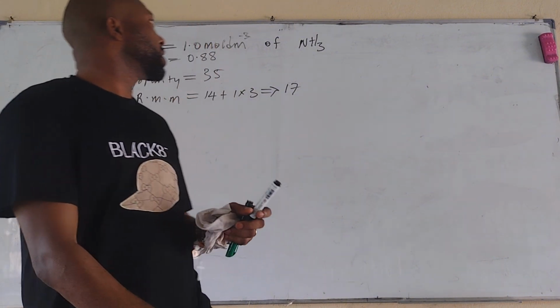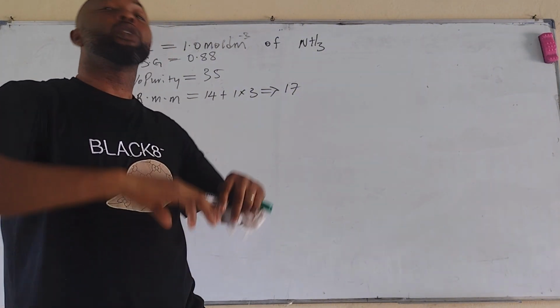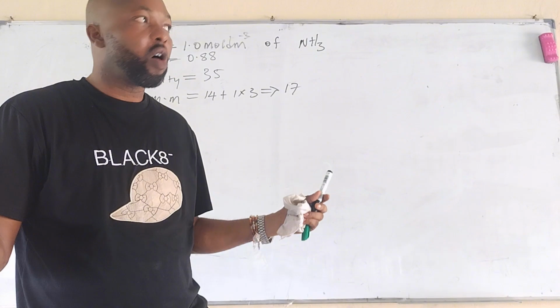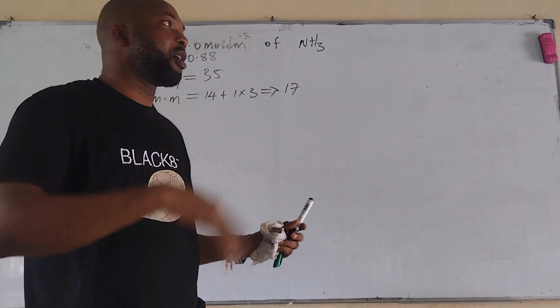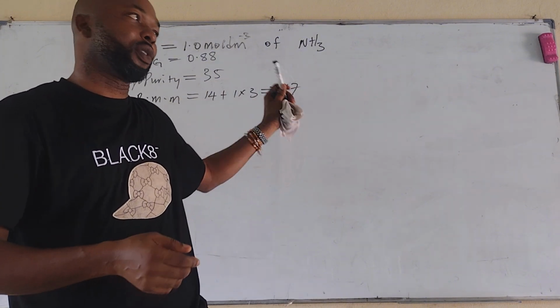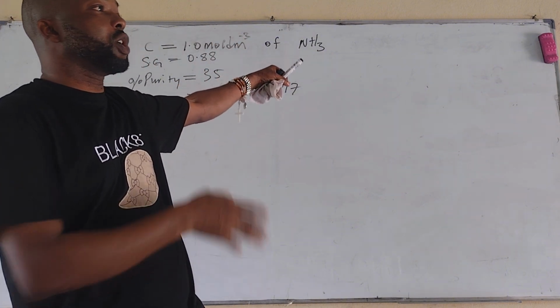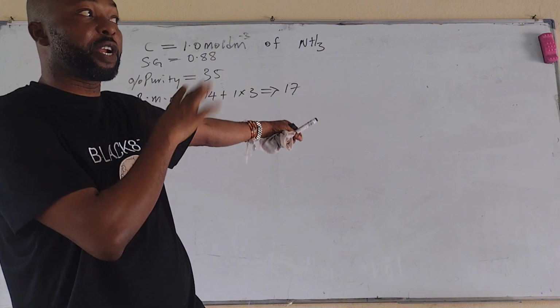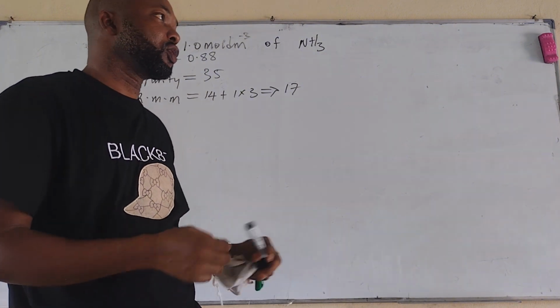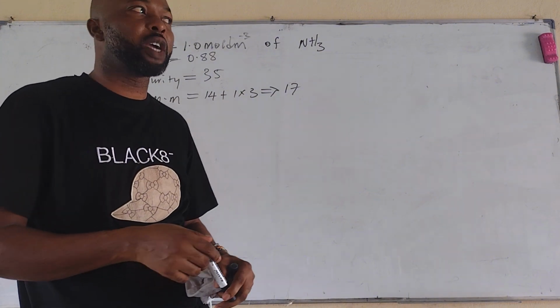Ammonia gas, in short, is the only alkaline gas. All bases are always solid, but this is the only one that is a gas. So by so doing, the reason why I'm adding it here is because what we have been preparing so far have been acids all along. So do not think that the formula can only be used when you're dealing with acid.